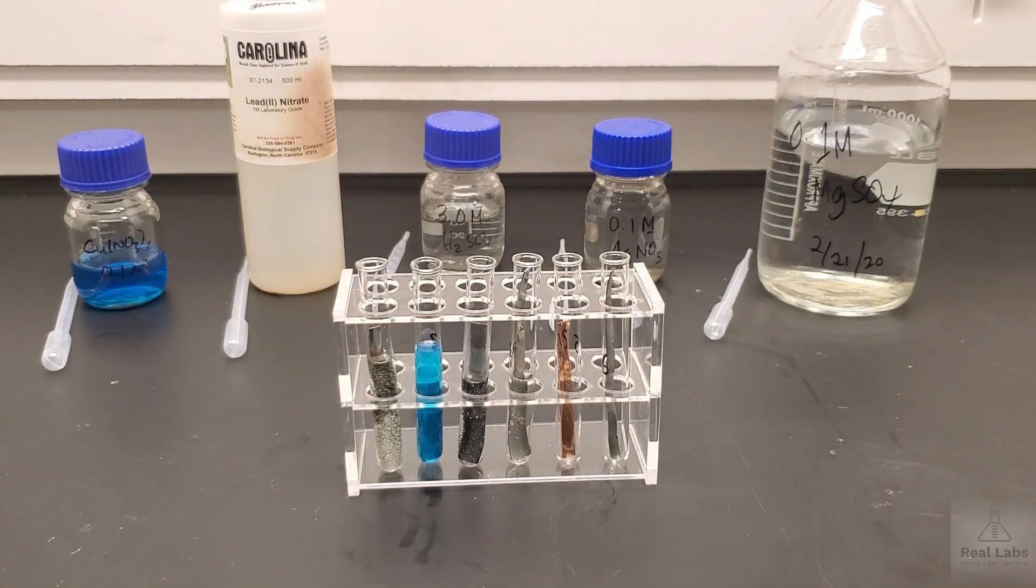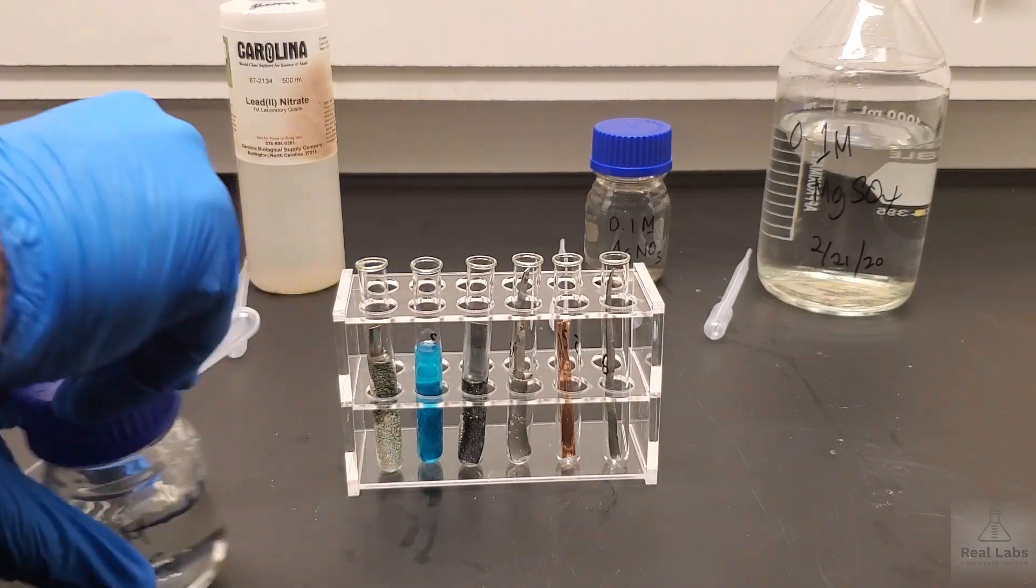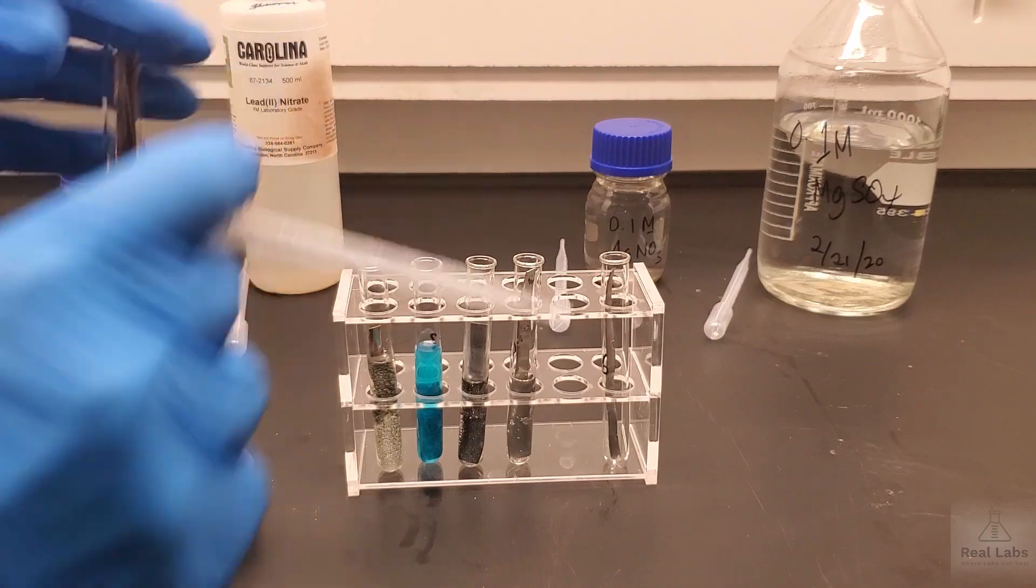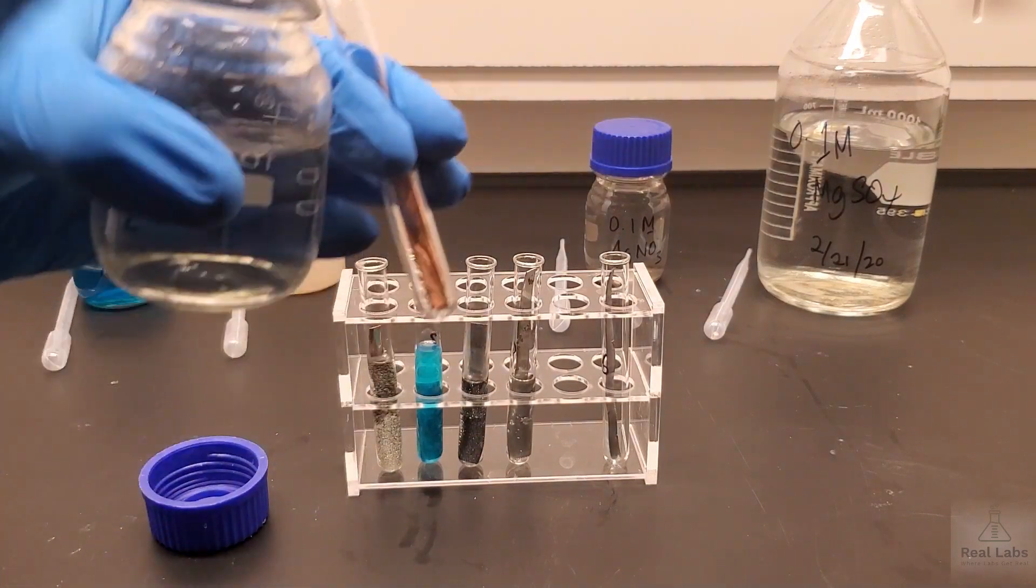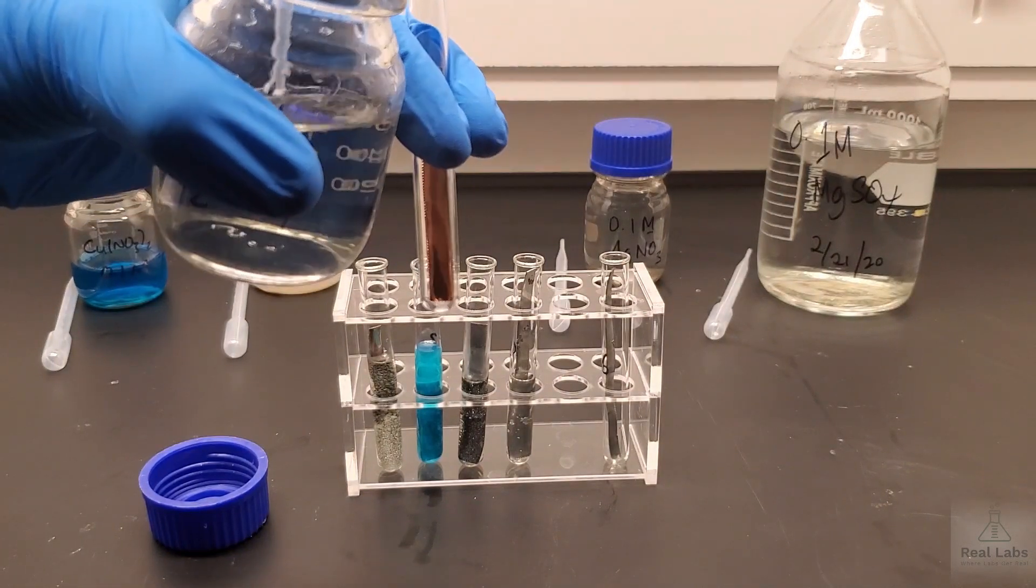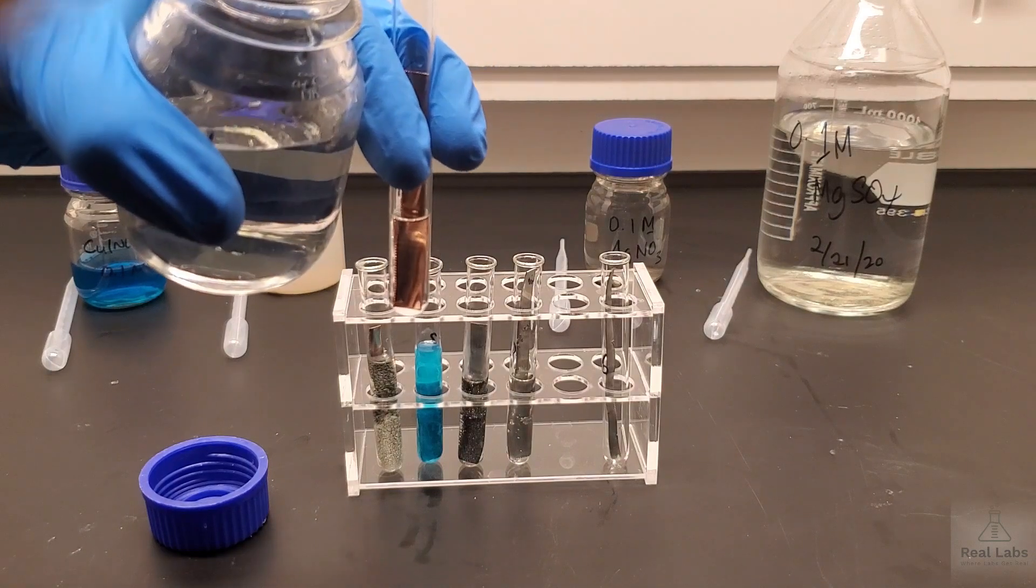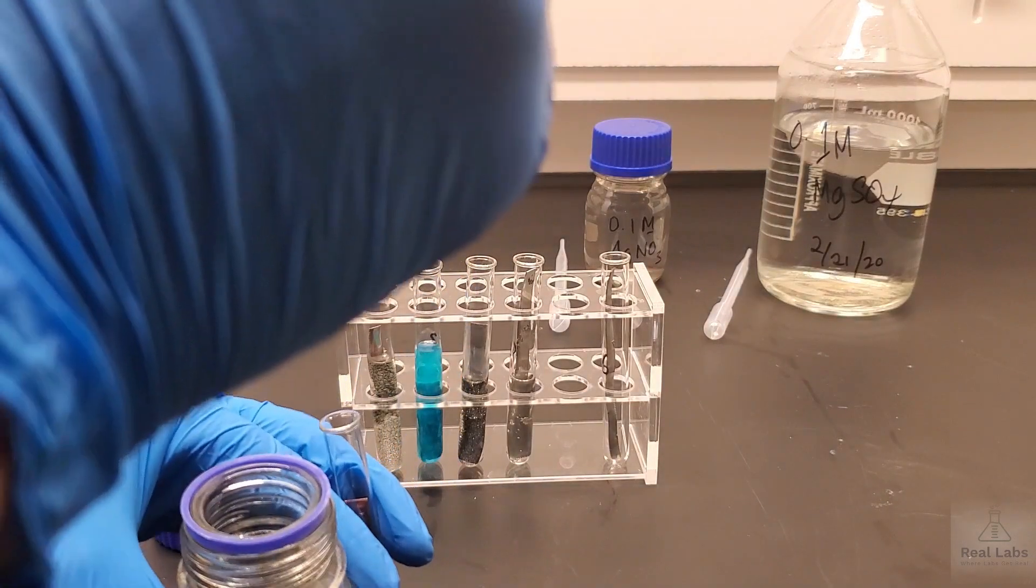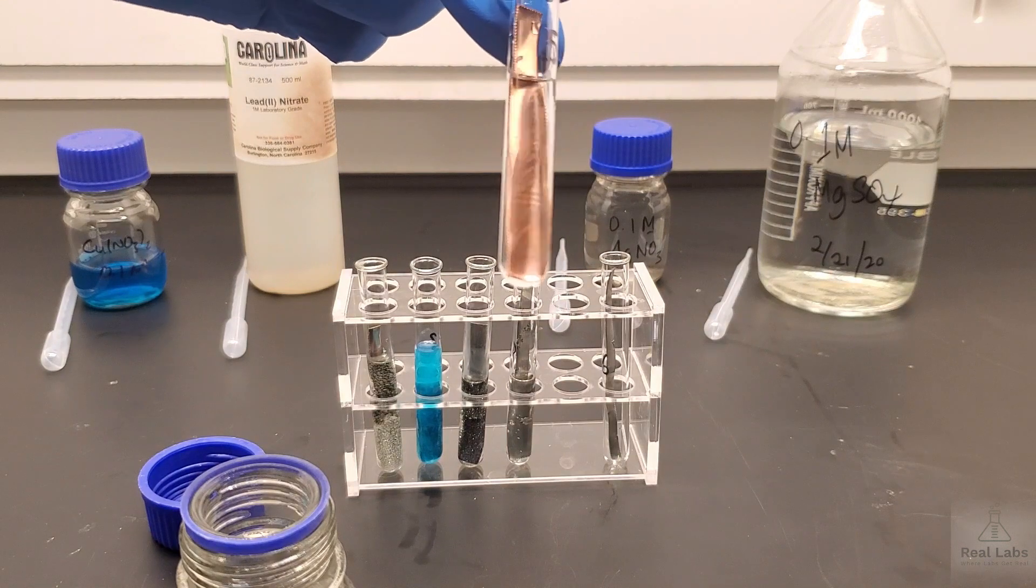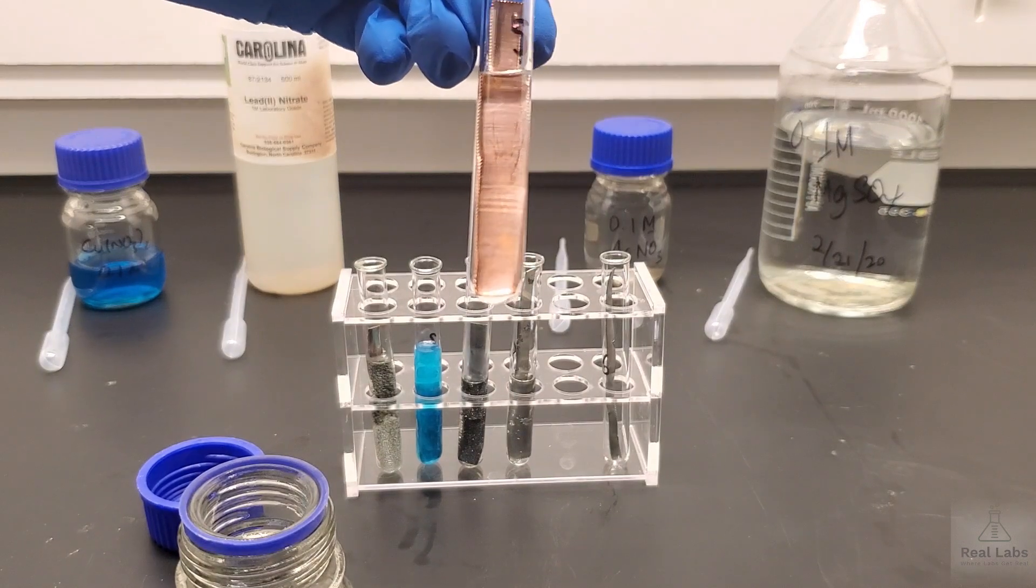In the fifth one we have the copper strip. We're going to add 3M sulfuric acid to that one. Just like before we're going to about half fill this with the 3M sulfuric acid. We'll see if we can see anything happening at the same time. Looks nice and shiny underneath. We'll bring that into shot so you can see if anything's going on. Still looks pretty shiny underneath. Not seeing any real effervescence of any kind in there. We're going to let that go for a little while.